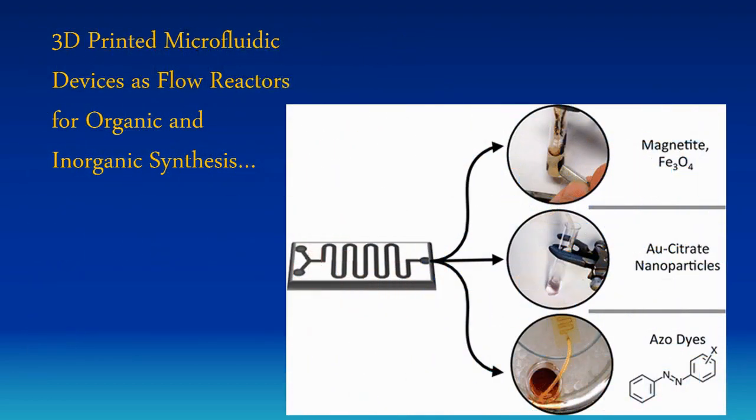So here's an example of what I have mentioned before, making a microfluidic reactor. So in this case, a real simple diagram is shown there where you have two reactants enter into the flow chamber, and as they flow through the chamber, they react and mix, and the output, you can then collect your sample and then do different types of analysis.